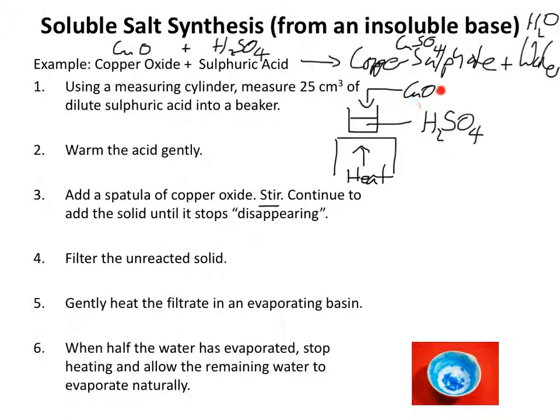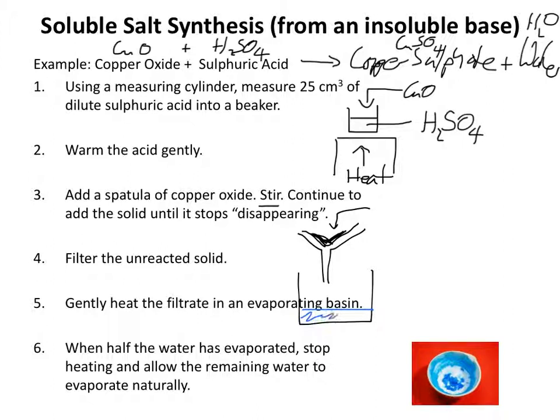What we'll be left with is a solution of copper sulphate and some sludgy black copper oxide on the bottom of the beaker. We don't want the excess copper oxide, so we filter it using a filter funnel with a piece of filter paper. The copper oxide sludge builds up on the filter paper, and the copper sulphate solution comes through. It's probably best to filter it straight into an evaporating basin.